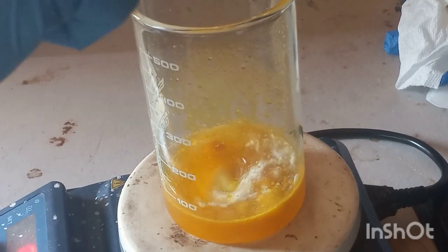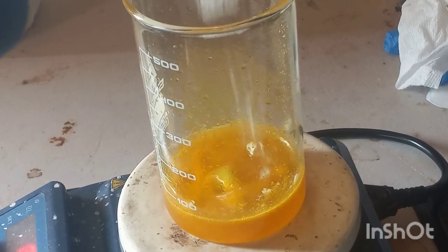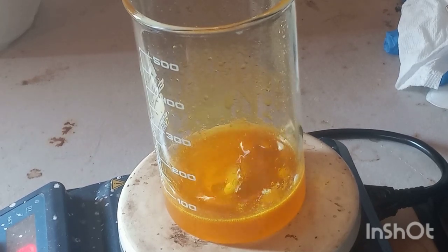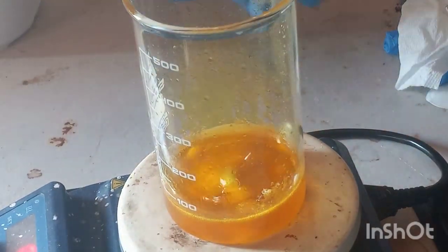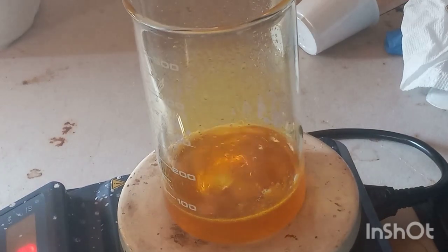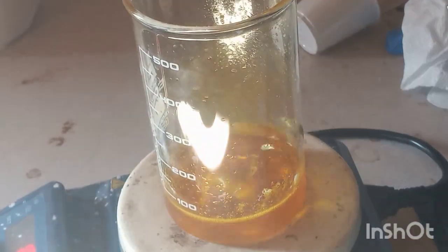I'm doing about 20 grams of ethyl vanillin, just to work on a visible scale. Since I don't have the best production quality, I want things to be pretty noticeable. Everything will dissolve. I'm going to go ahead and set this up and grab a thermometer — I shall return.